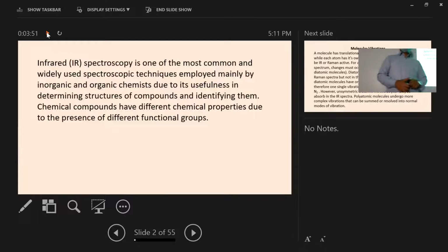So there is no way you can directly confirm whether the molecule should have this structure or this structure. If you have the mass spectrum, you can get an idea of the molecular mass of the molecule. In that case, you can guess that this molecule can have structure either 1 or 2, any one of them. But in addition to the mass spectrum, if you have the infrared spectrum, you can find out what types of functional groups you have.